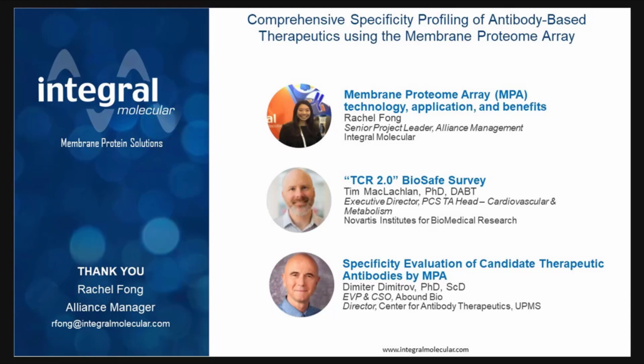So like I said before, I think it's more about doing these things to have a full understanding of what the biology of your product is. And now we have a technology to get that more information, whereas just doing IHC on tissues gave you some information, but really didn't give you much about the characteristics of the binding.